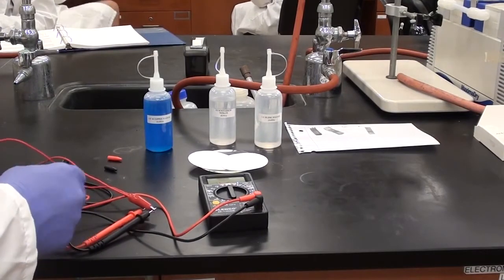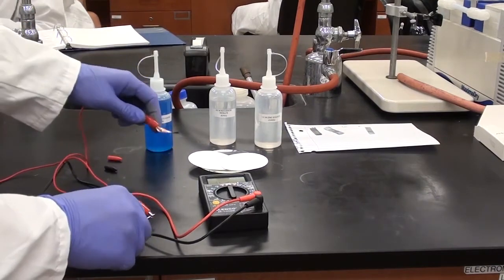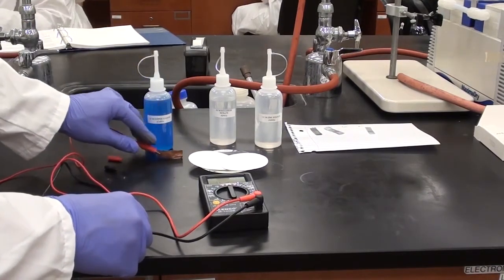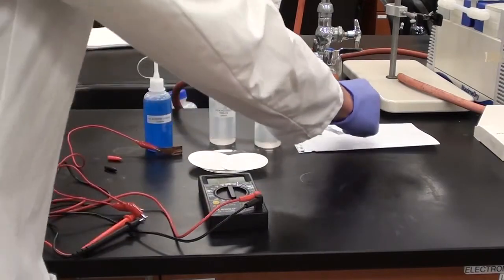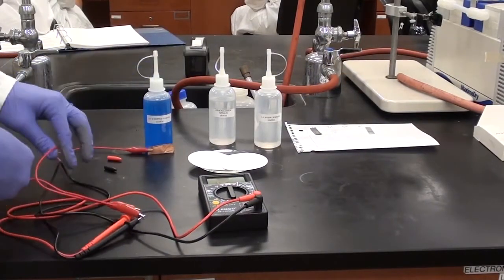So that's the negative and that's the positive, right? Yes, it is. Okay, so that's the positive. It's going to attach that over there, and he's going to attach now the zinc to the negative. There we go. He'll put that over there as well.